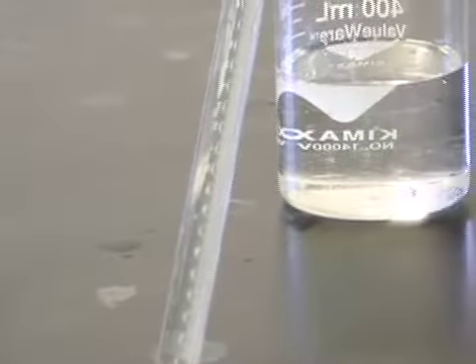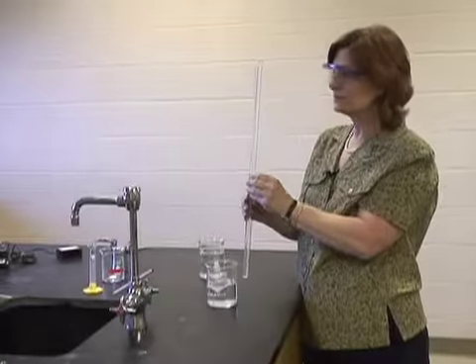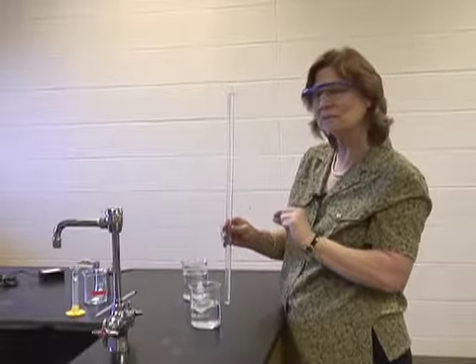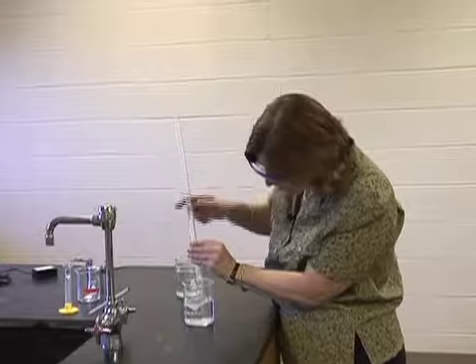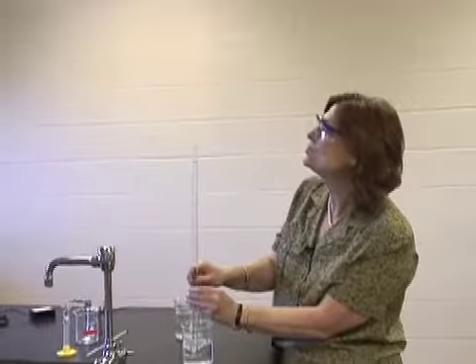And remember, I poured it all the way to the top because it seemed to have a bigger bubble there. Now, sometimes we could use our finger to hold it, but I'm not going to worry too much. I'm just going to quickly invert it. We see that it's up here. I'm not taking the volume here. I take the volume after I've turned it upside down. So are you ready? On your mark, get set, go. And I go quickly and I put it over top of the magnesium, and then I get my initial volume.